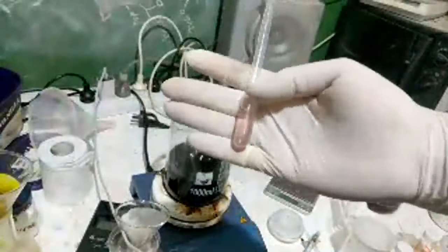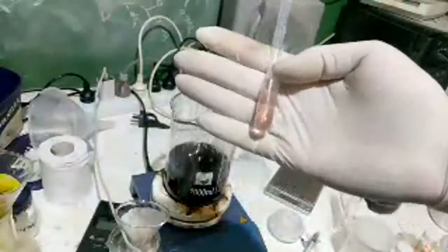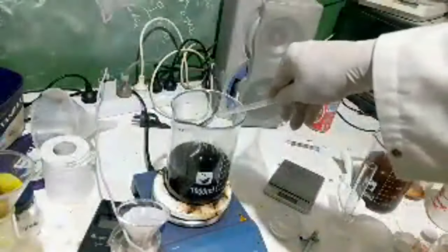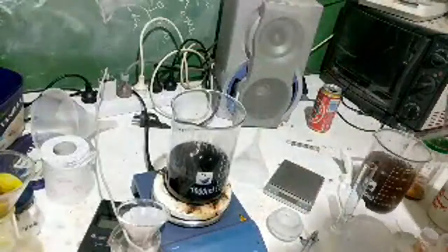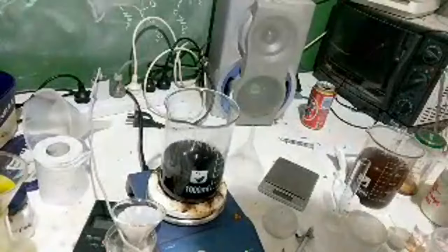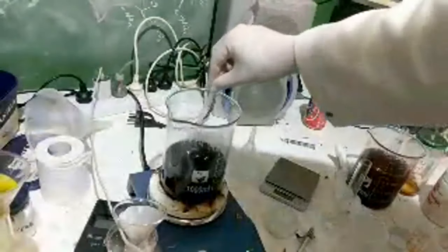Yep, good enough. Look, someone said it's purple. It's so dilute, it's probably dispersed iron oxide. But you know what? At this point, we'll take the win. We'll just say, yep, hey, look, we made it. I said I'd demonstrate high oxidation state iron, I did it. I think the thing to do is just to leave these solutions overnight, because it is looking like they get better with time. We'll give this one more filter.